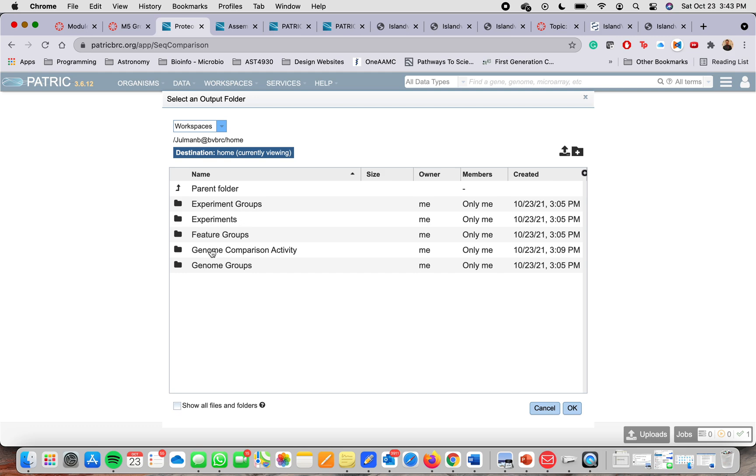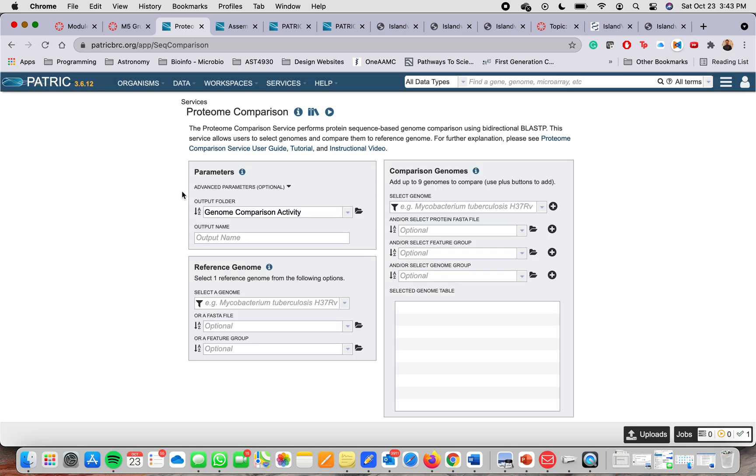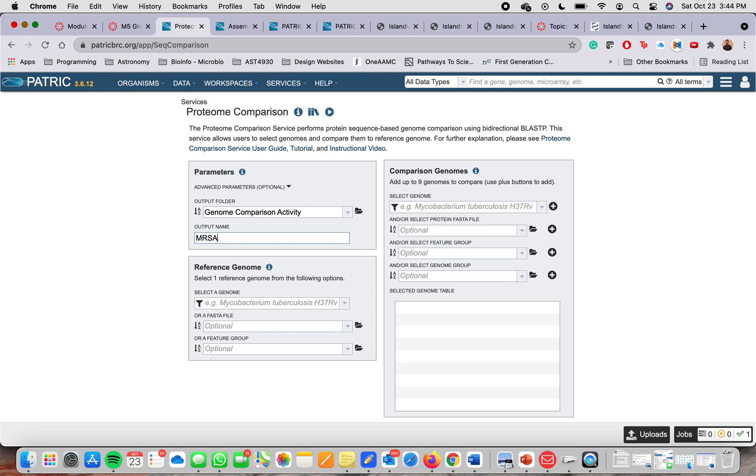Once you have it, mine was genome comparison activity. I click in there. And then I did double click. And then you press okay. And you see that the name of the folder will display here. And then you want to give it a name for the output file. It will produce a file. Once you do your comparison, it will produce a file with all the details. You can do like MRSA 252 versus MSSA 476. That's going to be the name of your file.